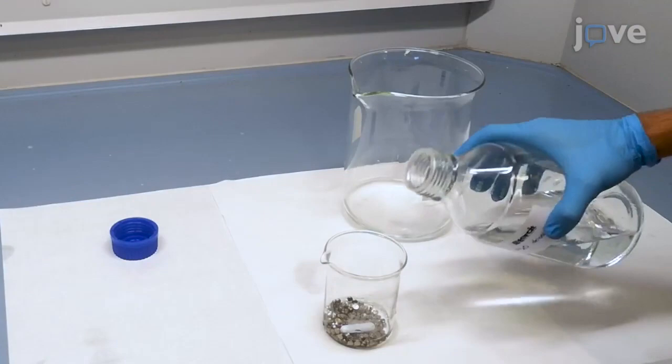Next, perform at least five washes of the implants with deionized water until the pH is neutral on the pH indicator.